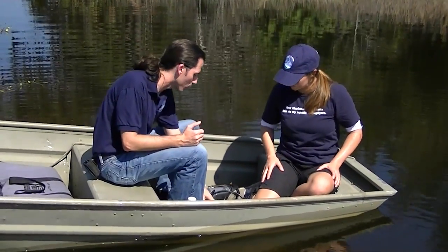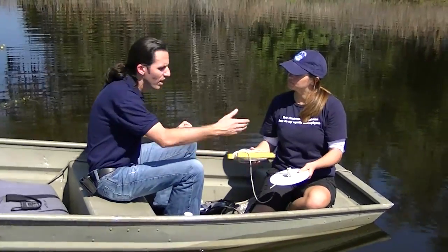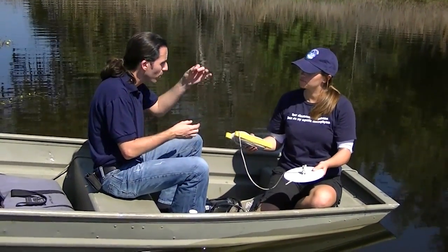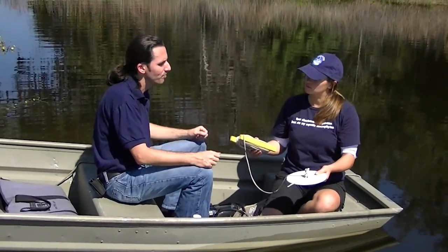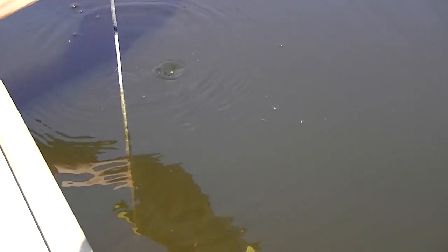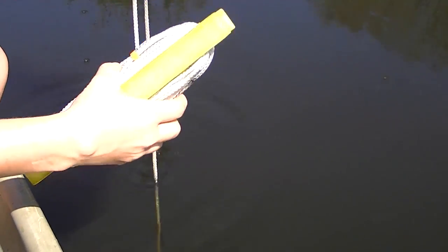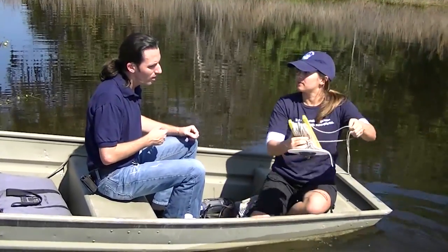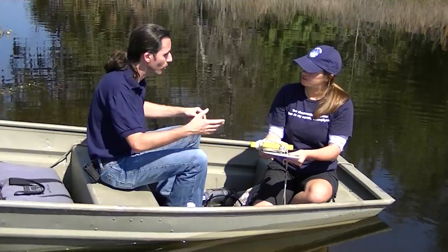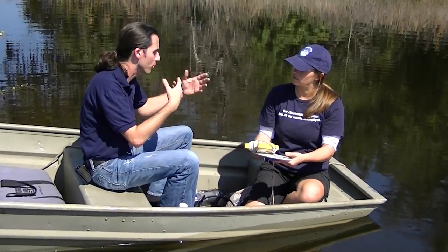One more thing we're going to take a reading on is a Secchi disc. A Secchi disc is just this white plate — sometimes you see it with a black and white pattern. We use it to measure how clear the water is. Our rope has markings every foot, and we lower it down in the water until you can't see it anymore, then pull it right back up until it just reappears and find exactly where that point is. A little over three feet. An important thing to remember is that you don't want to wear sunglasses because they can influence how deep you can see into the water. It's also a good idea to have the same person do the Secchi disc every time for consistency.